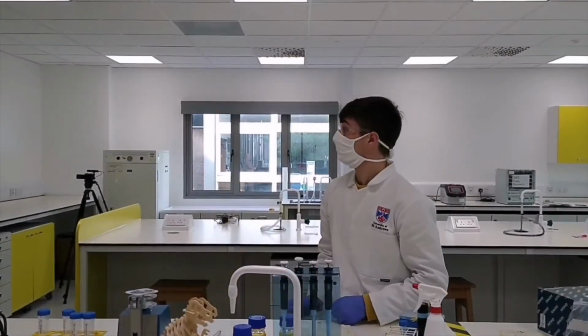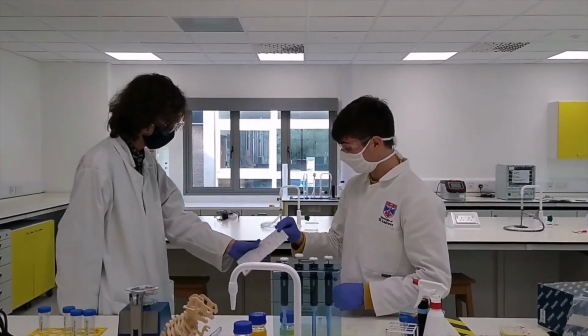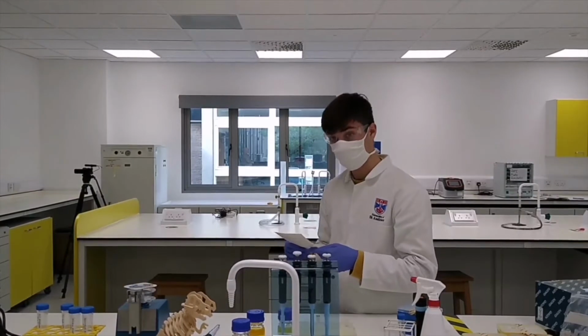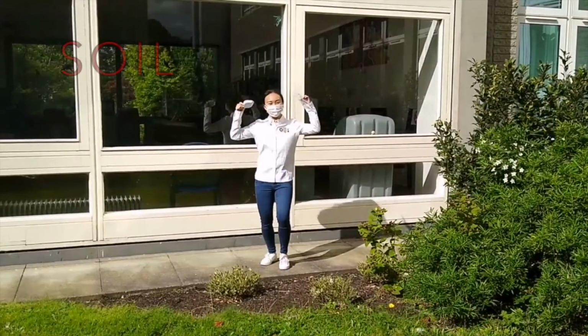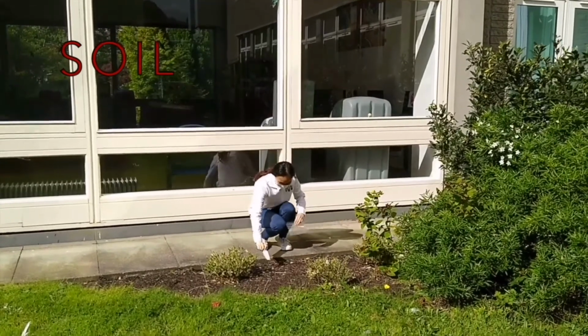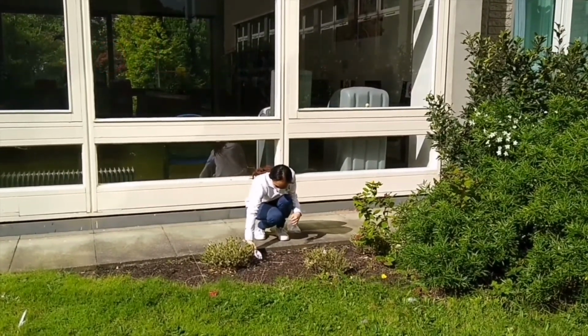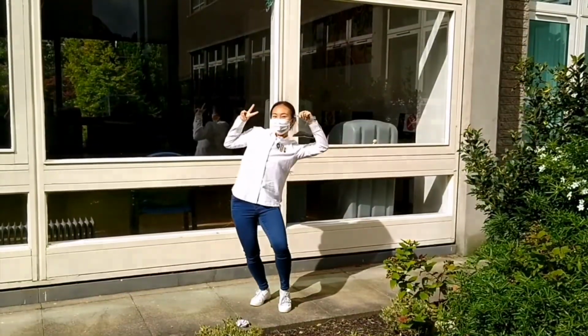Welcome to the lab. Before getting started, Adam needs his instructions for carrying out his tests. But the first thing he needs is some soil from his garden. Success! Once we have some soil, we need to keep some extra stock in case we need to test the soil again or Adam makes a mistake.